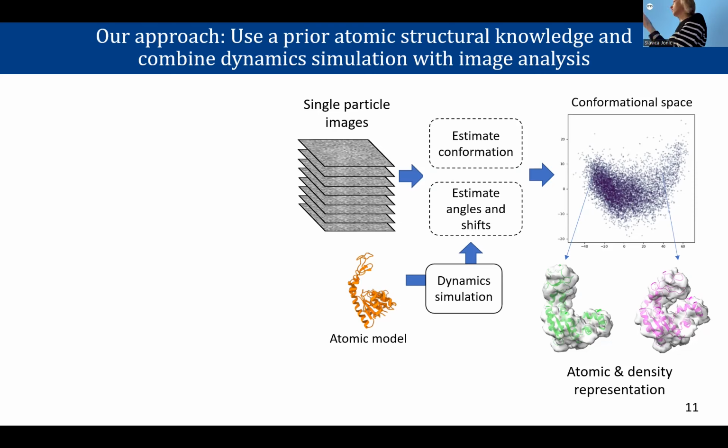Particles, and I get a 3D reconstruction. So this is what I said. We get first atomic structures, and then we get the density maps by reconstruction from groups of images. For example, from here, I can group this because for each point, again, I have one particle image. I have all rigid body parameters for this image.